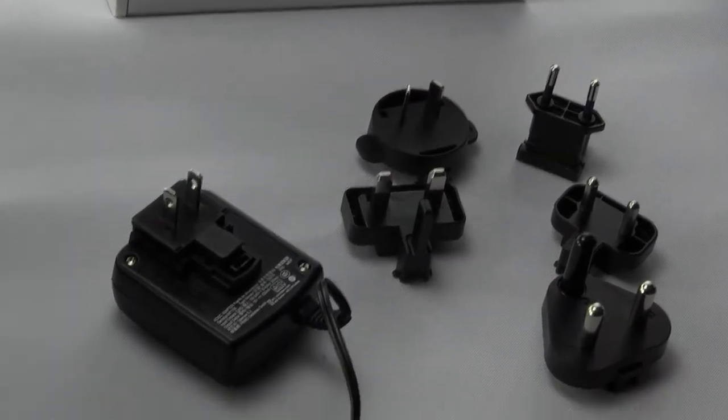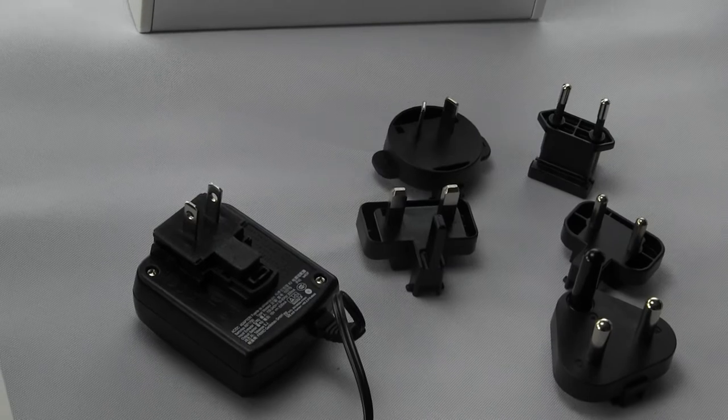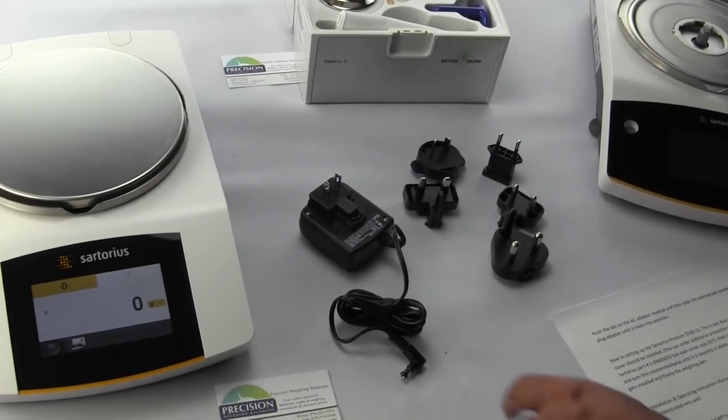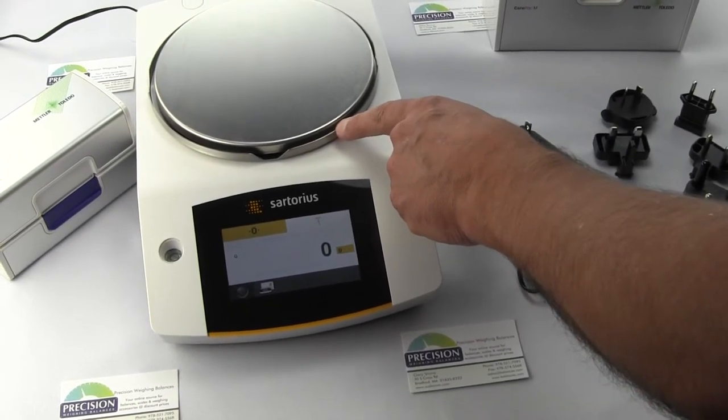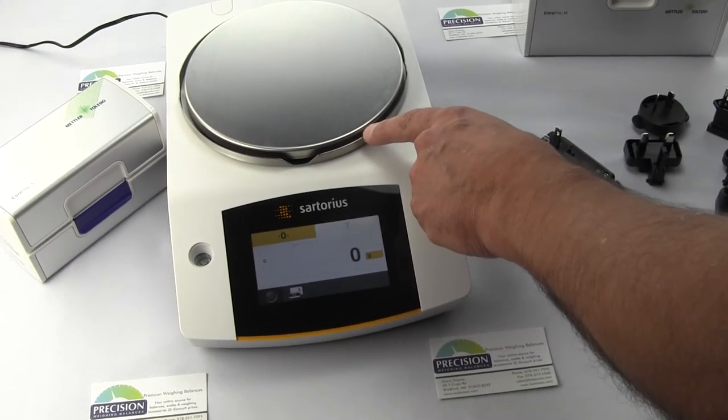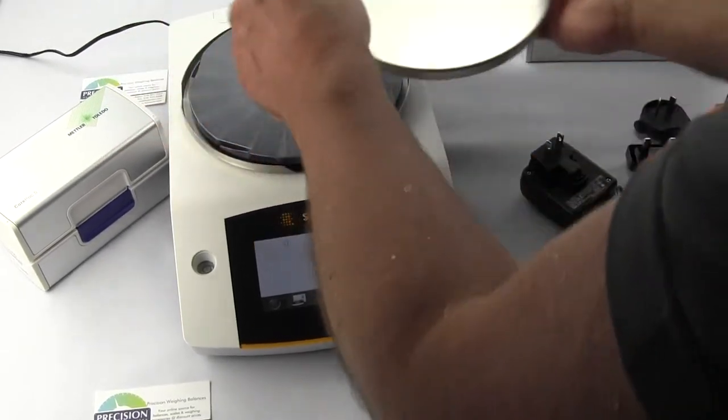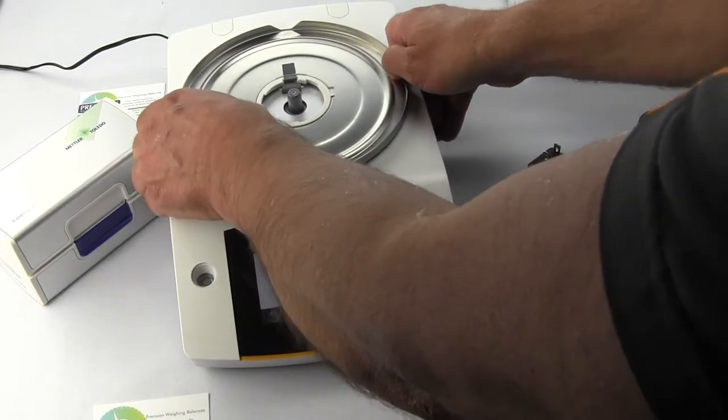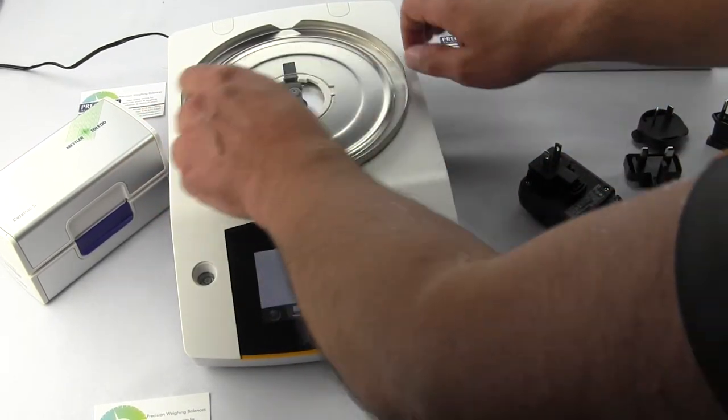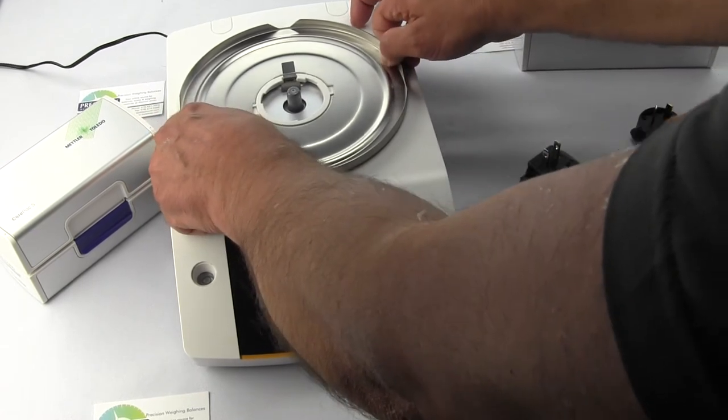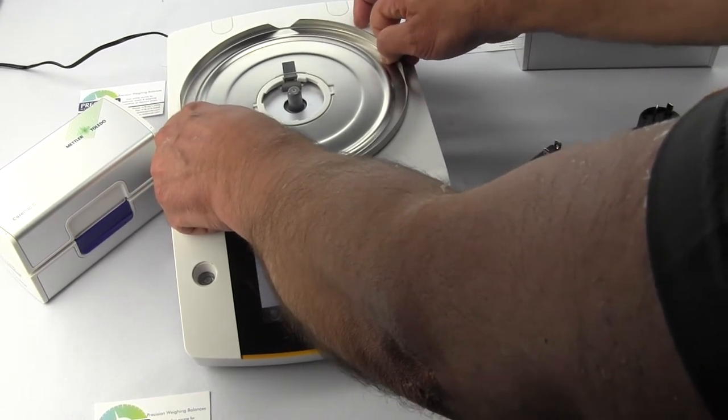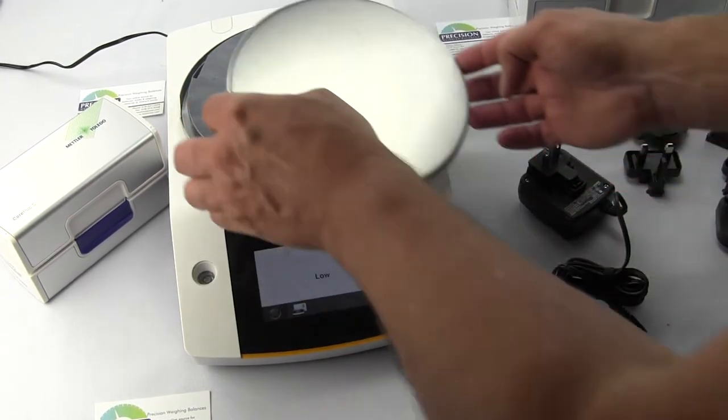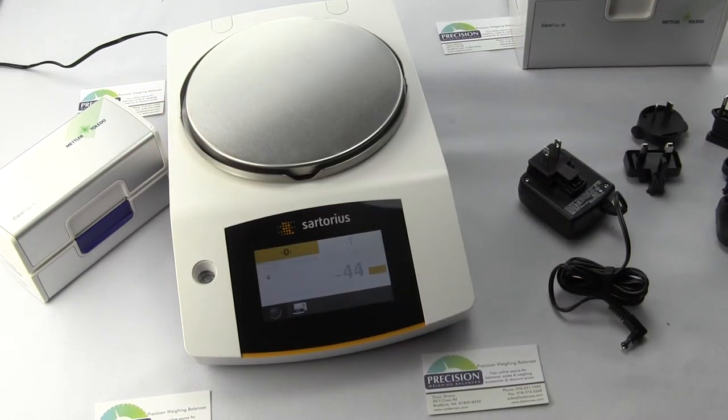For setting up the 5101, we showed you the dust cover and discussed how you can buy additional ones. This is called the shield disc. When you receive your unit you have to install it. On the shield disc you'll see two tabs, so you rotate it counterclockwise until it's snug, then put on the pan support and pan.